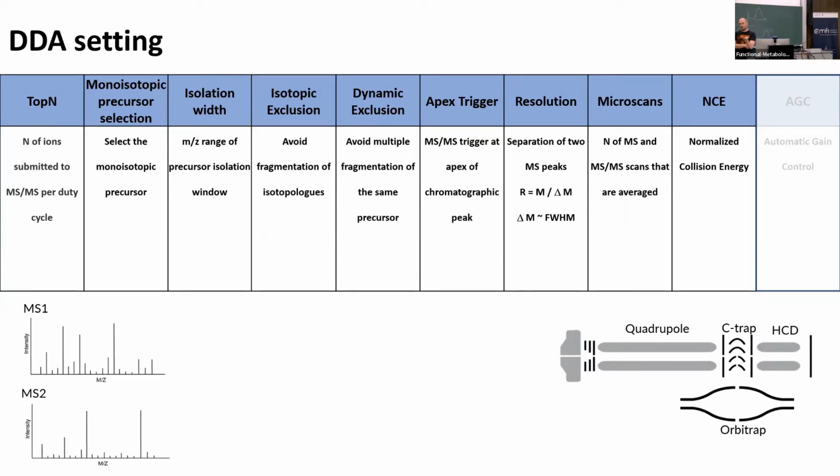I agree. The trade-off is again speed, right? If I get 3 single MS events at 3 collision energies, I need to use 3 scans. If I do it stepped, then it's only 1 scan, so I have 3 times more MS. Now, if I have a very simple sample, or let's say a natural product, I isolate it and I want to find out a lot about the structure, then I would for sure run it at separate, different collision energies, because I have the time to spare. Not in a non-targeted experiment of thousands of different compounds.